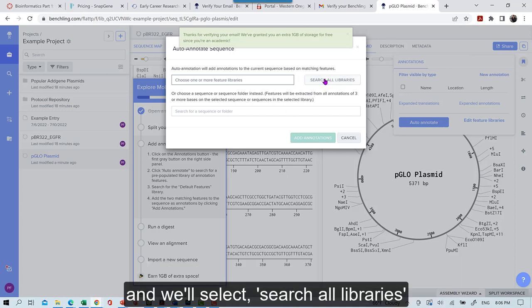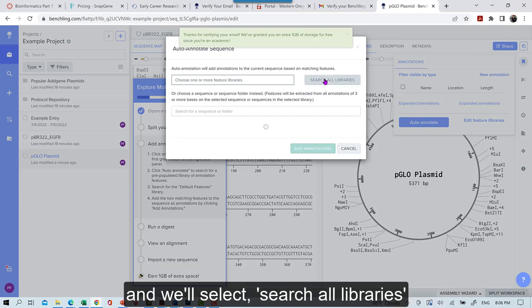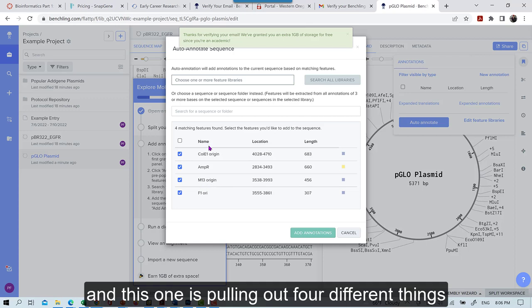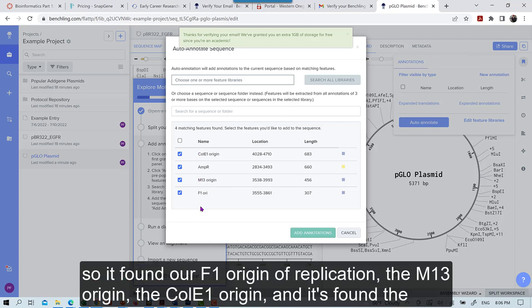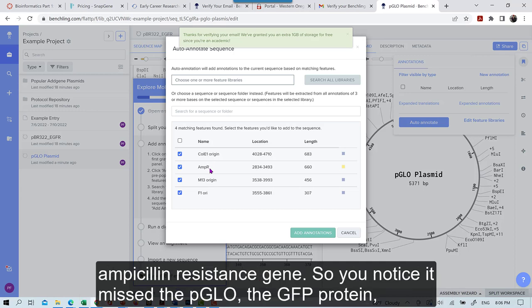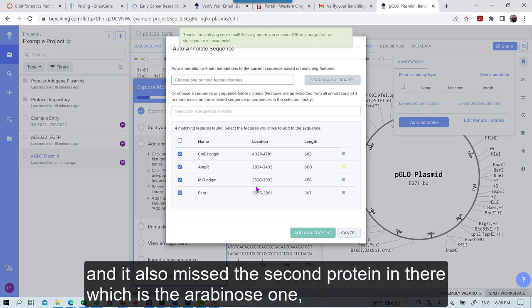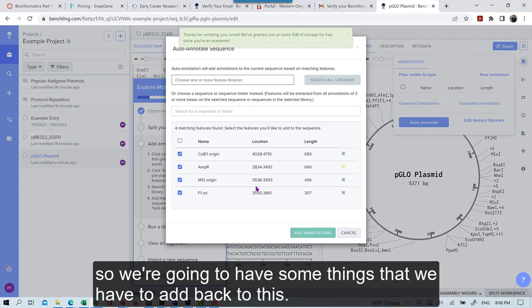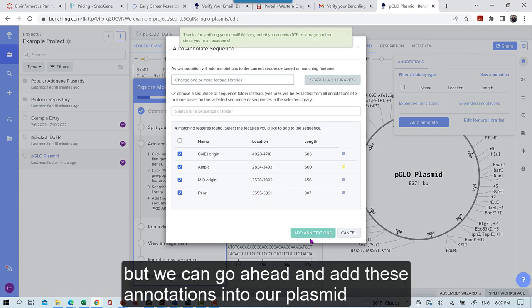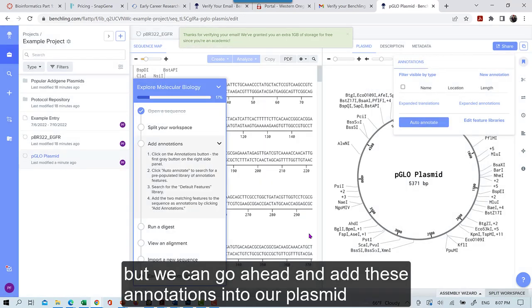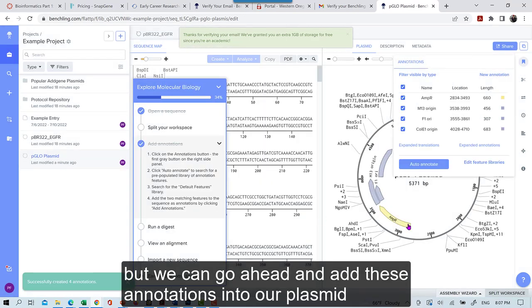And we'll select search all libraries. And this one is pulling out four different things. So it's found our F1 origin of replication, the M13 origin, the Cole E1 origin, and it's found the ampicillin resistance gene. So you notice it missed the PGLO, the GFP protein. And it also missed the second protein in there, which is the arabinose one. So we're going to have some things that we have to add back to this. But we can go ahead and add these annotations into our plasmid.